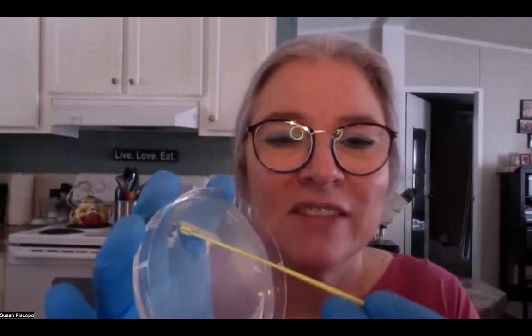So when you look at it, it looks pretty solid. And when I touch my inoculating loop to the surface, if I'm gentle, I can run my loop all over the surface of this. But if you're not careful, if you dig, you will break the agar. Can you see that? See what I've done? I've lifted it up. It has the consistency of what we might call gelatin or jello. I've got a little piece of it between my fingers and you can see I can squish it.